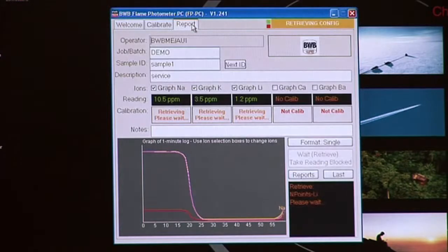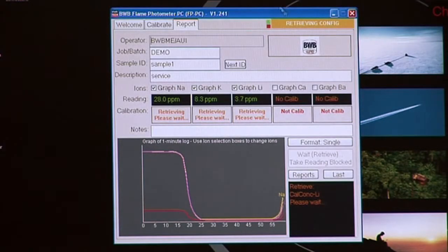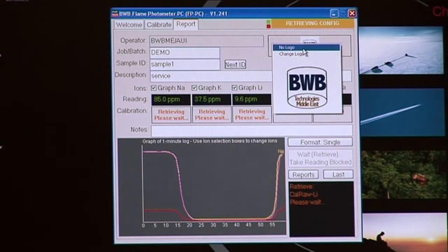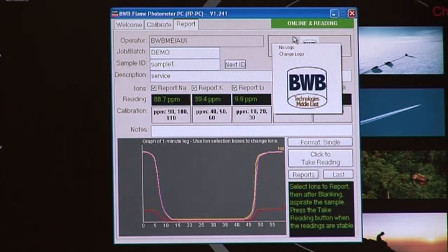Click on the reports tab. Now you have the option to click the logo box and add your own logo to any reports that are created.